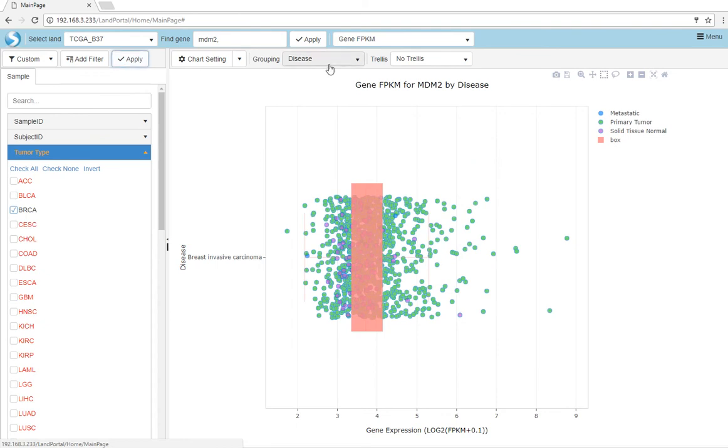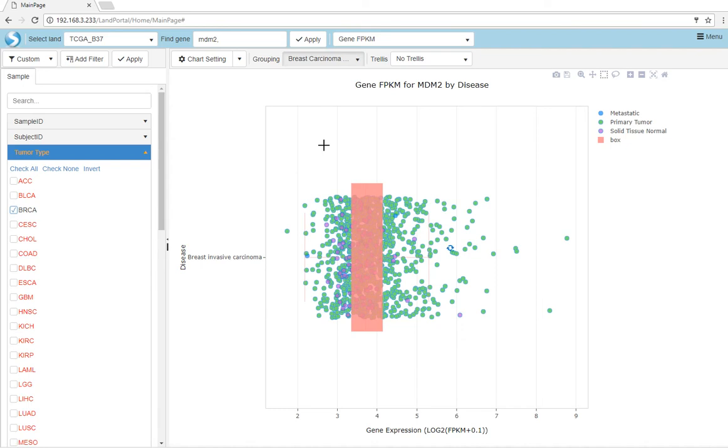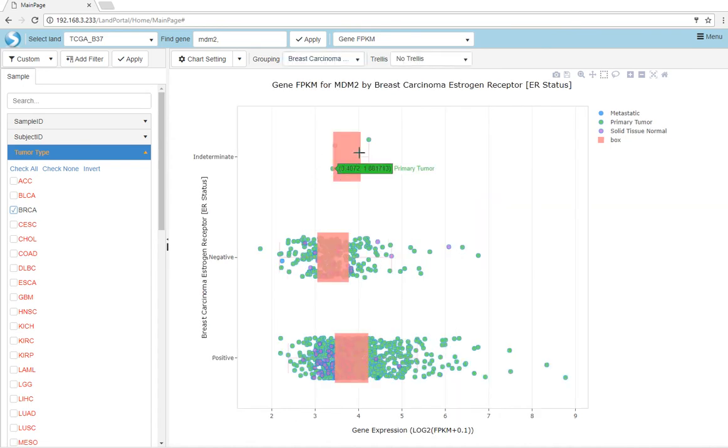We can use our new filter to further group our view. Now MDM2 expression is grouped by ER status.